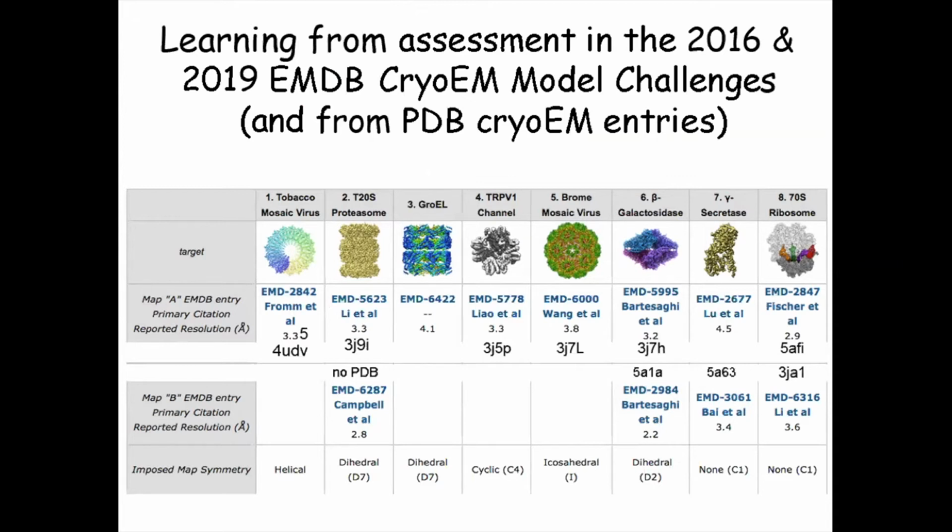But this one particularly, finished in 2019, used a number of quite different targets.